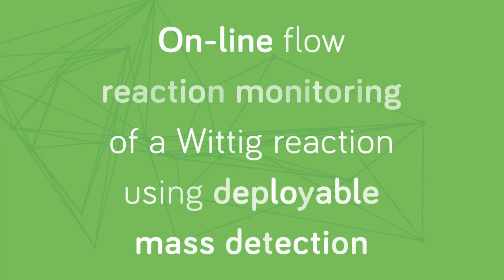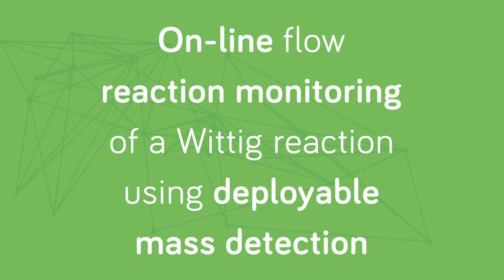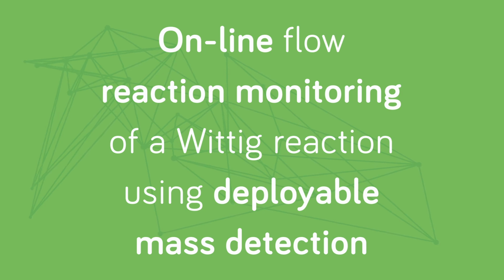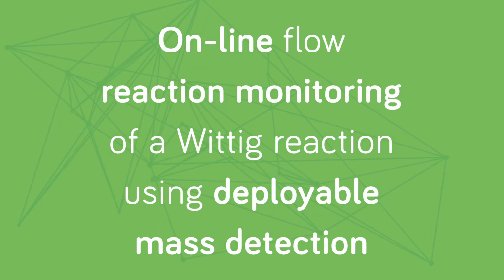In this application video, we are going to demonstrate how online flow reaction monitoring of a Wittig reaction can be achieved using deployable mass detection, or better known as mass spectrometry.